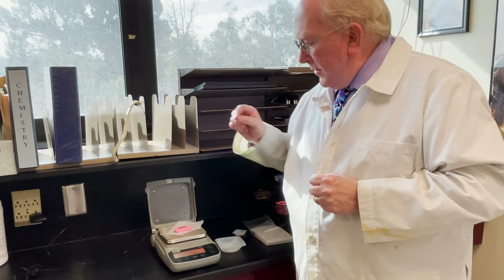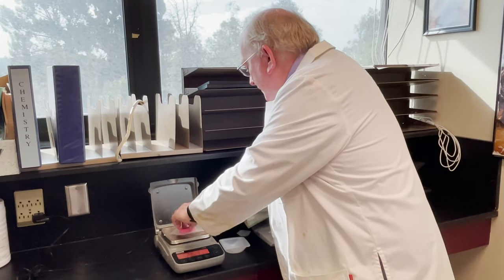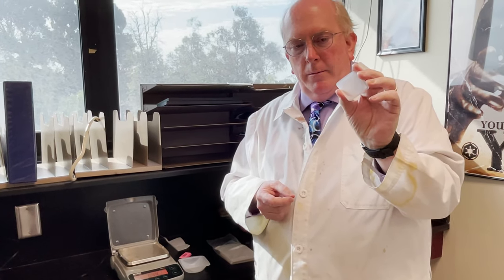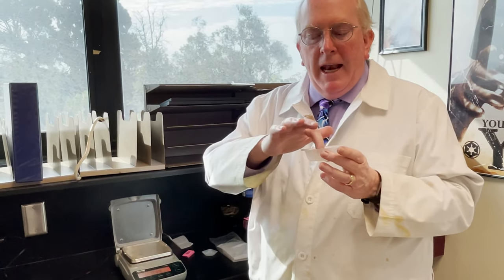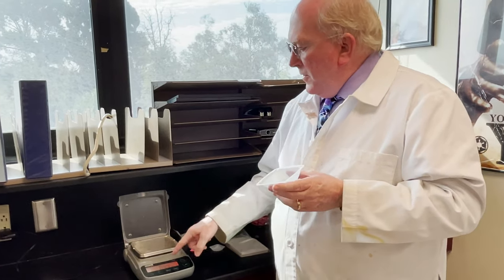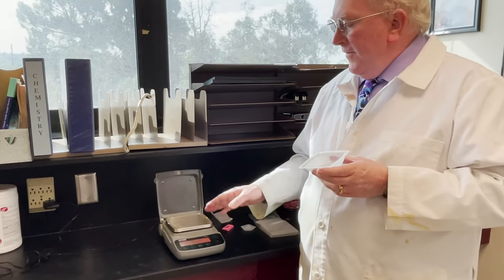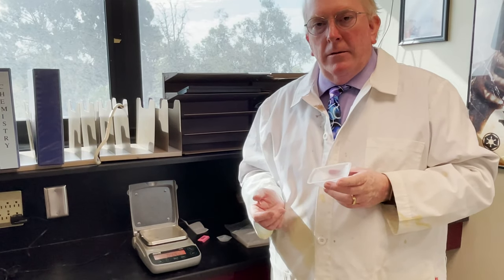You can put your powders or solids or whatever it is you happen to be weighing inside that. You'll notice we came up with the same number as we did before. Now weighing dishes can also be very tiny, for when you're working with incredibly small amounts. Personally, I like this size because if you're making a solution, you can add some distilled water into this pan once you've weighed out the solid and mix it up and then transfer it to another container. This balance goes to two places after the decimal. You'll find some that go to three places after. This measures centigrams. There are ones that measure milligrams and ones that measure a tenth of a milligram also.